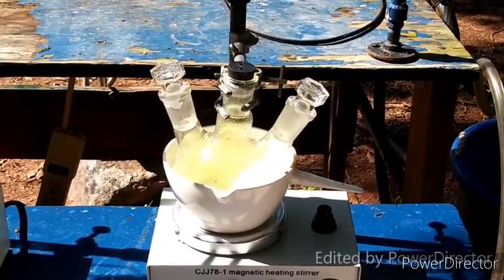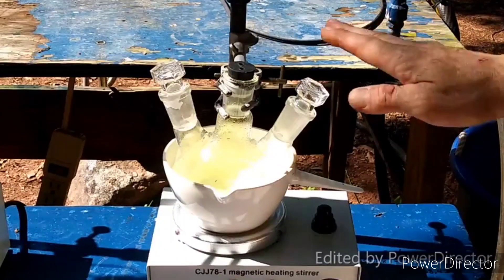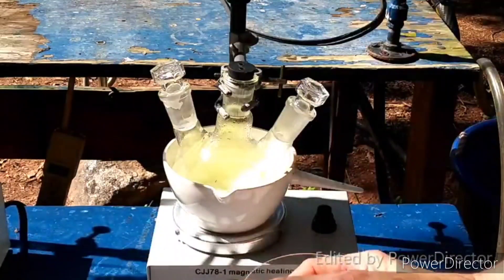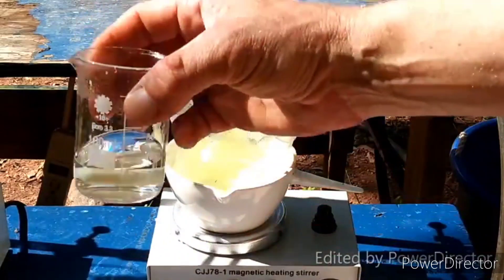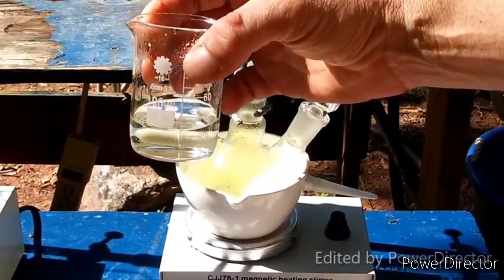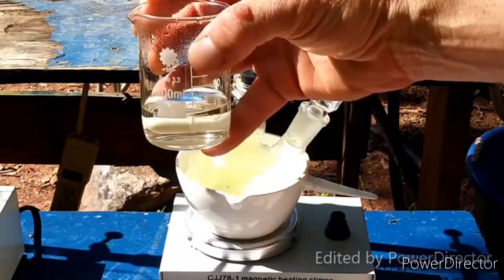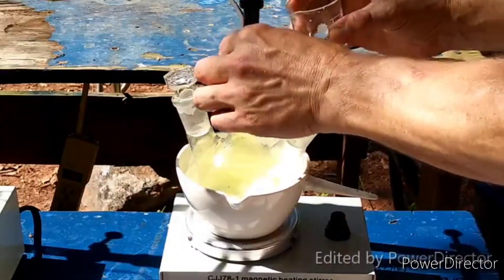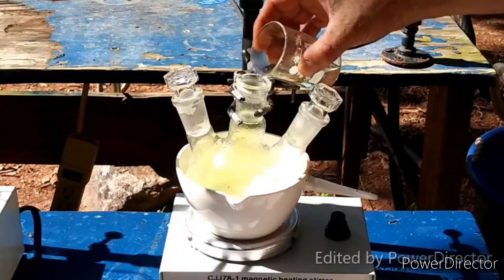This is at approximately 50 degrees. I've got a solution of ammonium chloride here. It got a little warmer than 50 degrees, but it's cooled down now — I think it's close. So I'm going to add this in here carefully.